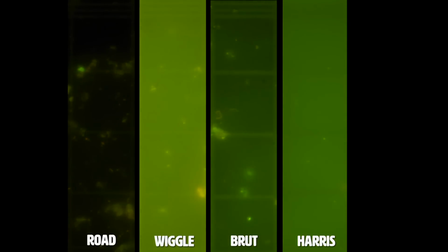But we just figured out, just with simple color coding, how to differentiate between different samples, how to differentiate their numeracy of life. And if you take a section that's really exemplary, has testate amoebae, has good bacteria, good fungi, all those things in there, it's going to be exemplary.